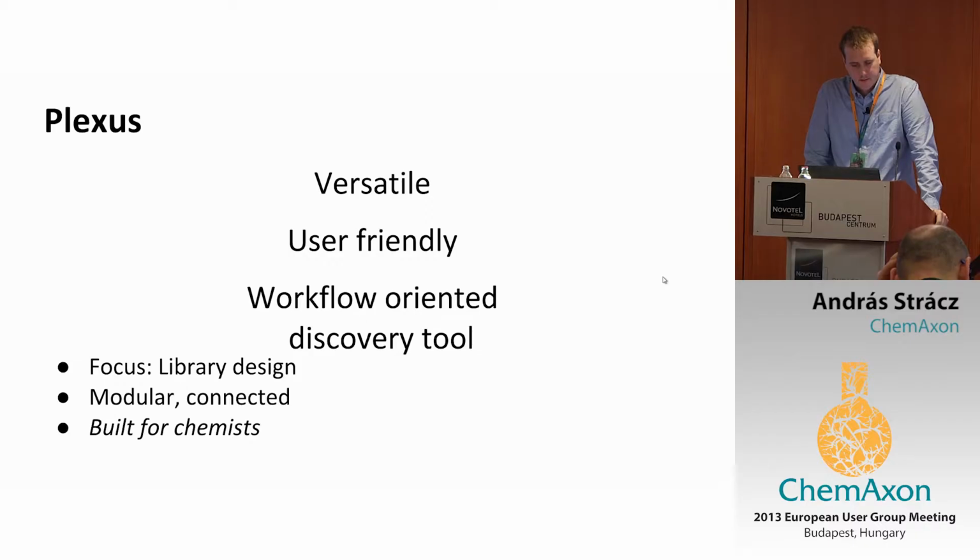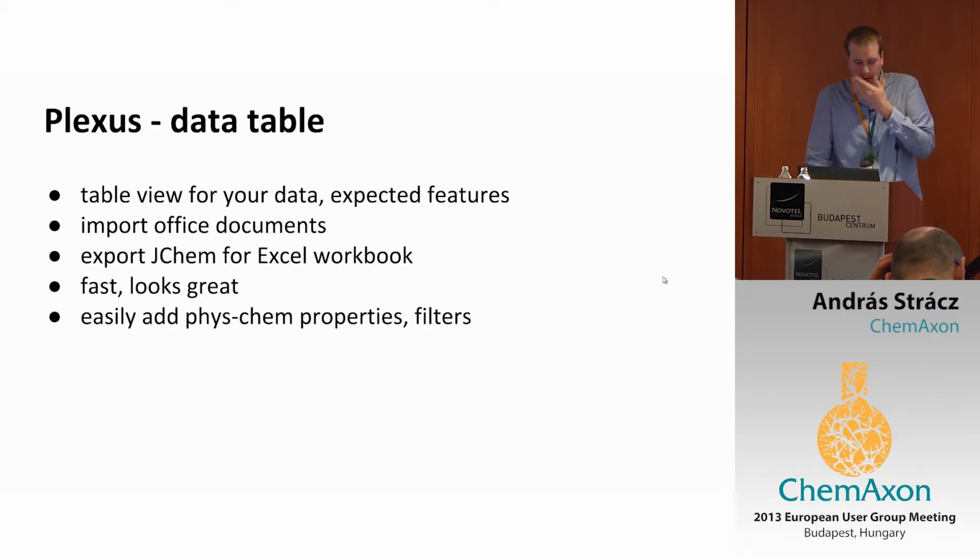And I want to stress that this is actually built for chemists. So we have lots of business analysts and application scientists who help us daily with issues on how to build this application. Okay, so let's get to some demos.